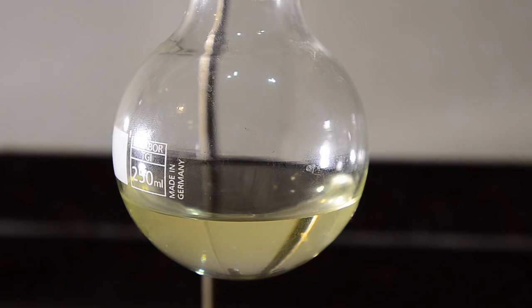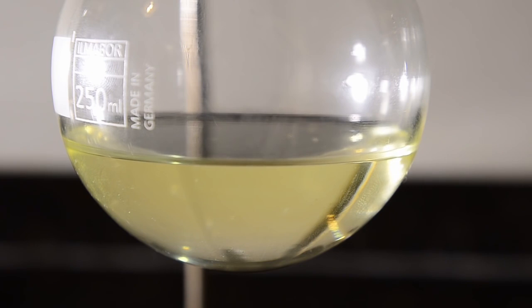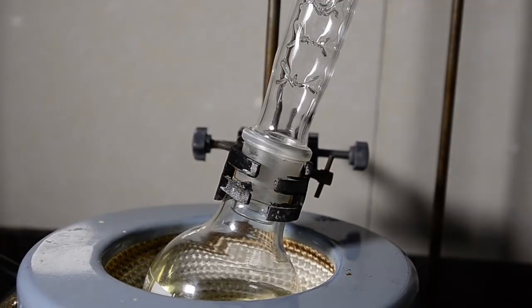Here's our final distillate, it has a slight yellow color as you can see. This definitely contains acetic anhydride, but also smaller impurities such as acetic acid and maybe some ketones as well.